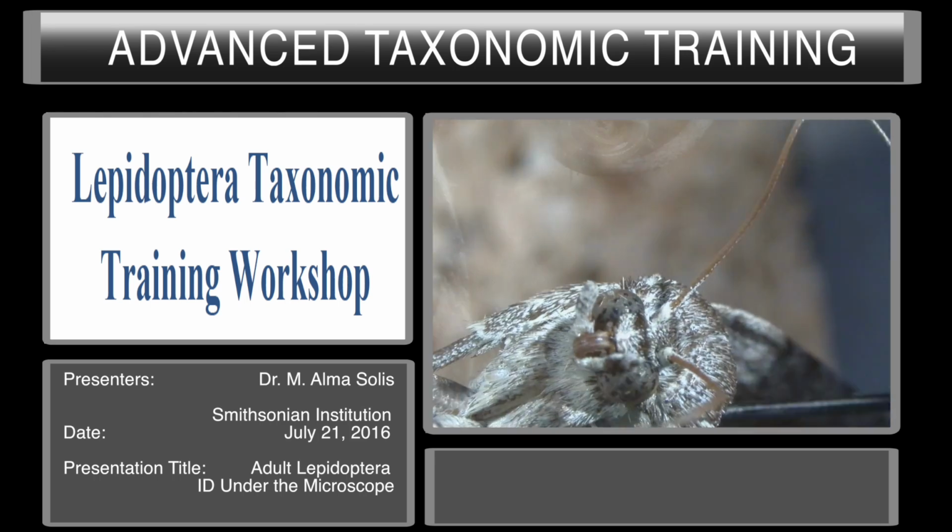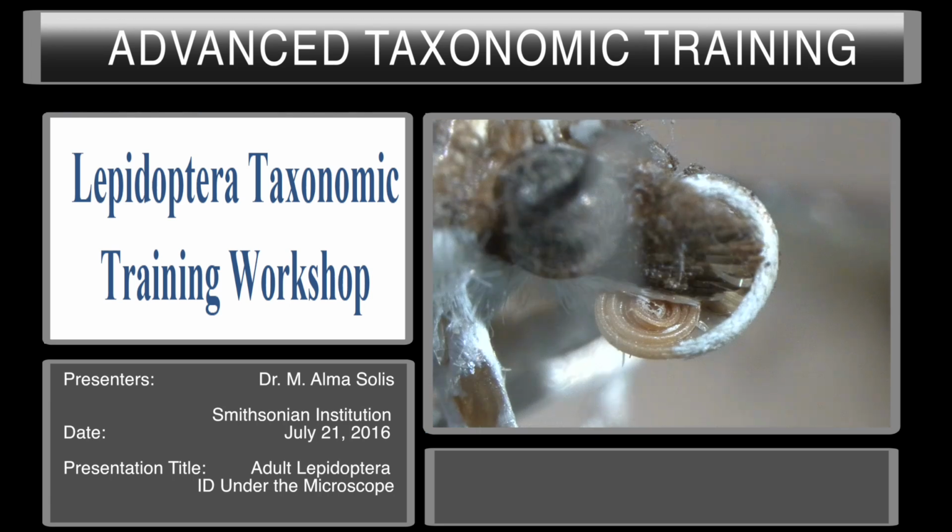and after you compare this to a moth with scales at the base of the proboscis, you'll see the difference. So here you have another moth, and the moth head. Here's the proboscis. As you can see, there are definite scales at the base. Then the rest of it continues on without scales. Many times you will see scales just lying on top of the proboscis. If they're not in an organized state like this, where you can see that they're flattened in a pattern, then it's just scales that accumulated from the trap or from moth scales flying.